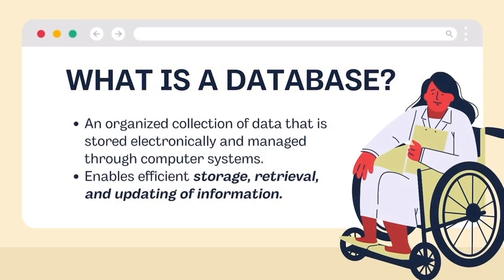What is a database? A database is an organized collection of data that is stored electronically and managed through computer systems. It enables efficient storage, retrieval, and updating of information, whether it's patient details, test results, staff records, or appointments. You can think of it as a digital filing cabinet, but one that is searchable, scalable, and far more powerful.